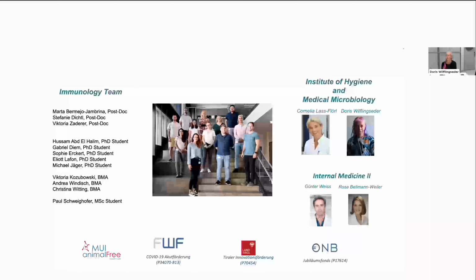We are changing the medium composition in the Clinostar to get an apical-out phenotype. I can't tell the exact composition right now, but we leave the organoids within this medium for 1 to 2 weeks, and then we get this proximally differentiated phenotype in the Clinostar.